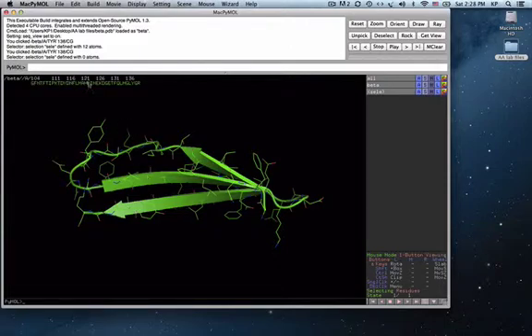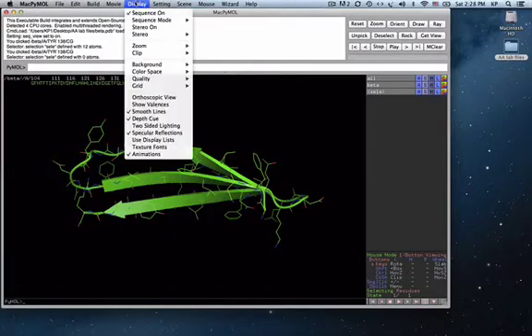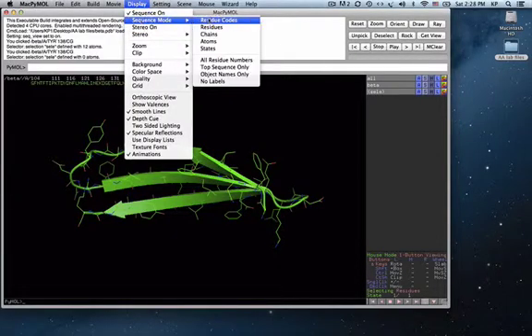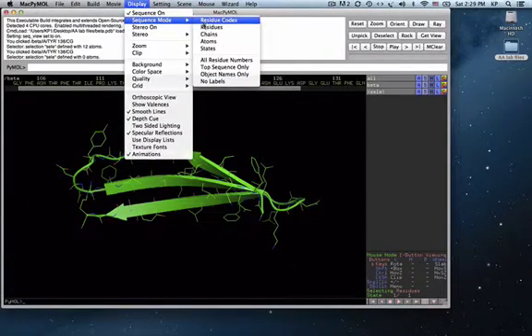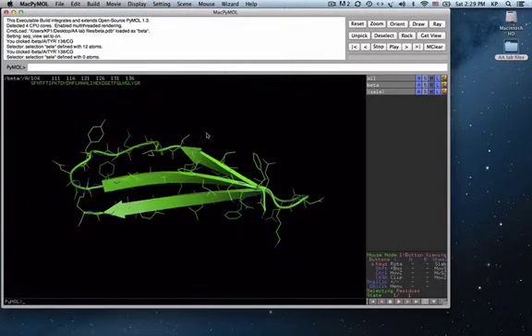Note that this is the primary structure up here, and this is showing the one-letter codes for the amino acid in the sequence. We can change the display of the sequence mode, and if you don't know your residue codes yet, which you should memorize, you'll need to know them for many classes, you can display as residues, and now you can see this is expanded out and we have the 3-letter codes for the amino acid residues. And I'm just going to go back to the code view for now.